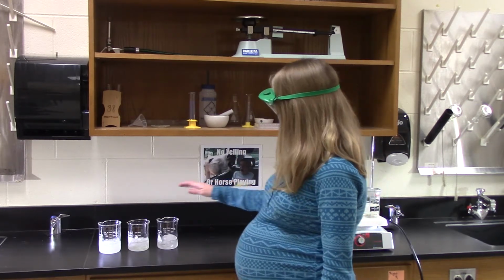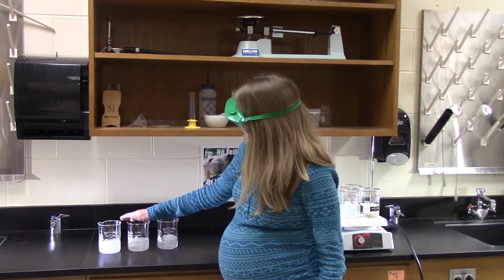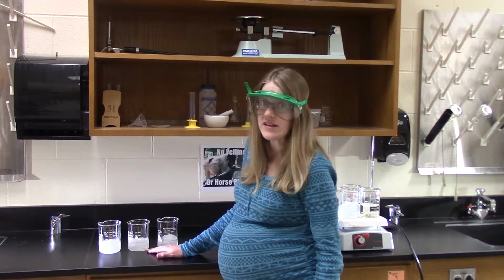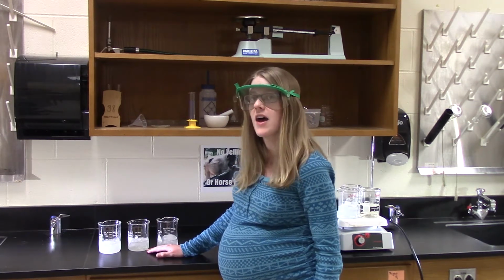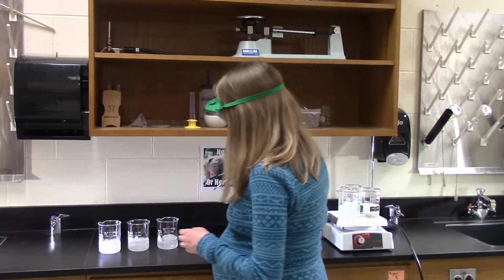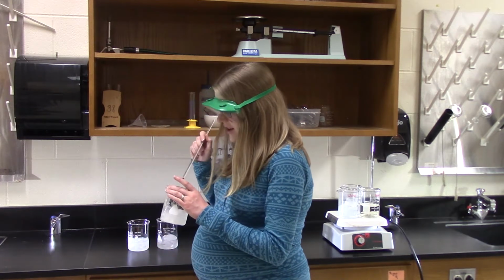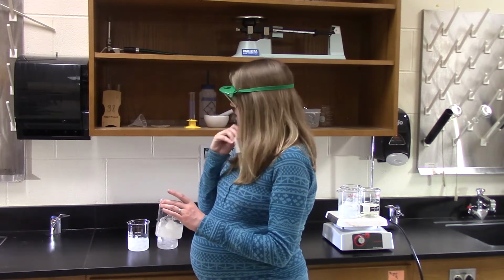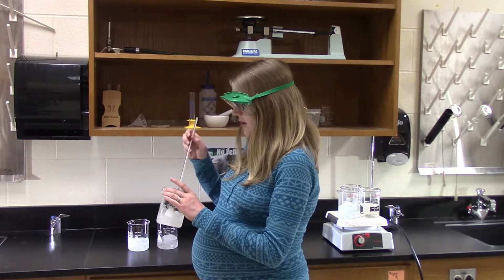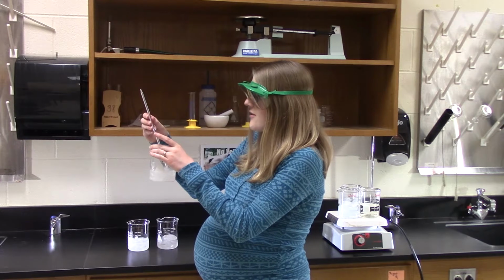So do you see that when we had ice by itself, it melted, the liquid in the solution was at 3 degrees. When we did the sugar, it was at 1 degree Celsius. So yes, we were able to get that liquid to be a lot colder. Let's check the salt. I'm hoping for something pretty low here because remember, salt is an electrolyte, so it's going to freeze at an even lower temperature than the sugar. Because not only is it a solute, it's also an electrolyte. So let's have a look at this one.